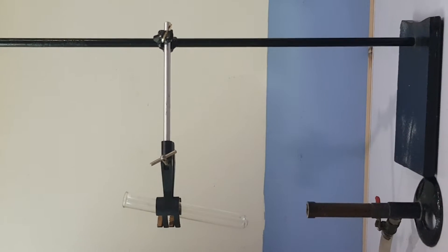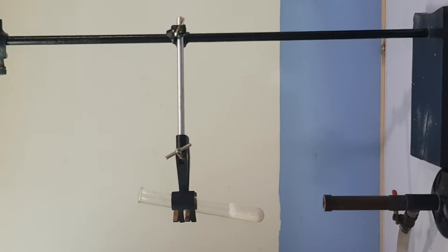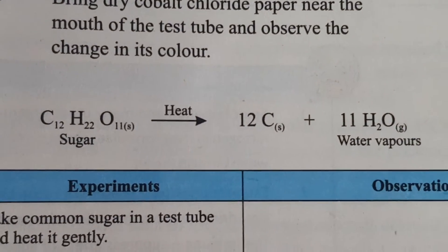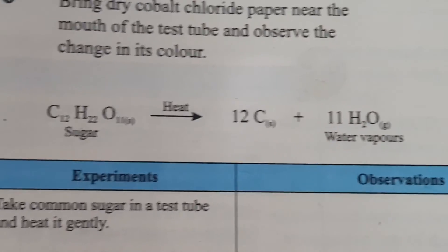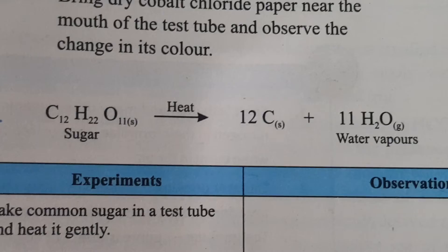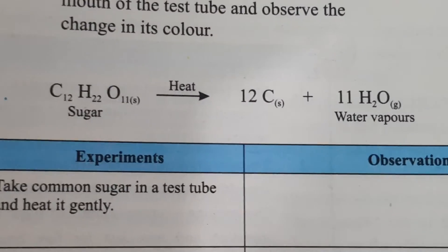Now add sugar to the test tube. We have added sugar into the test tube. When we heat the sugar, it will decompose into carbon and water vapors. The color of the test tube will turn black, which will prove the presence of carbon.